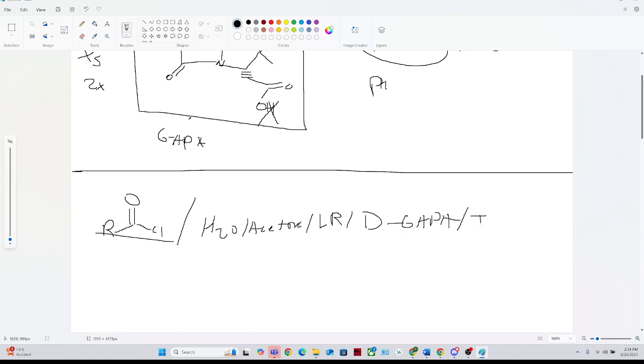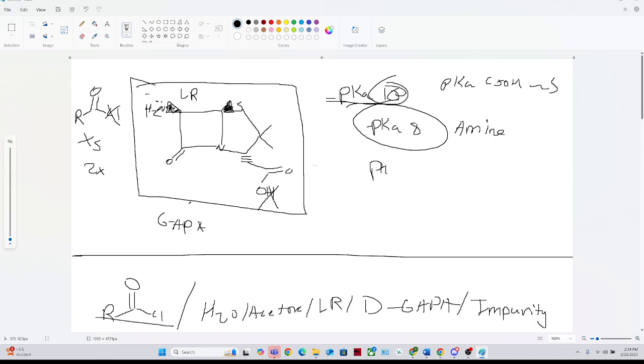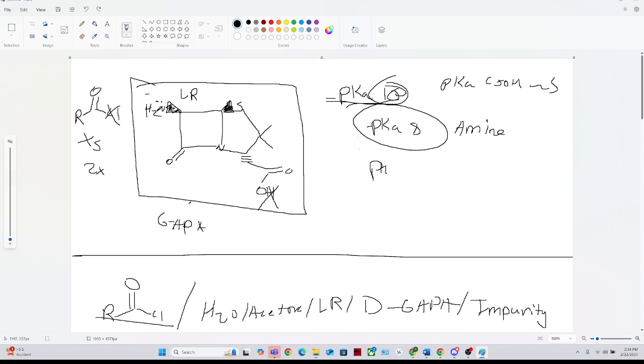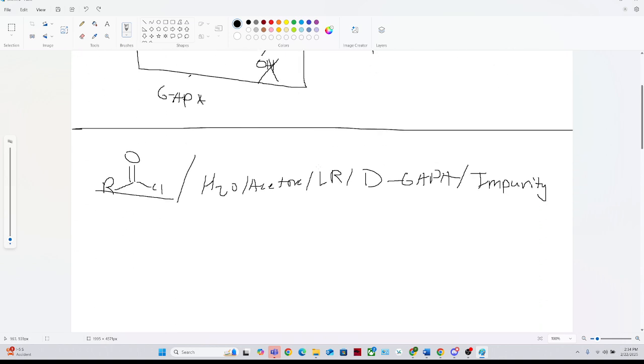And there's possibly some impurity, some hydrolysis of your beta-lactam, okay? This is like a question mark, and really this is also a question mark. It just depends on how lucky you are and how much of this is an issue. But this is a worst case scenario, effectively.